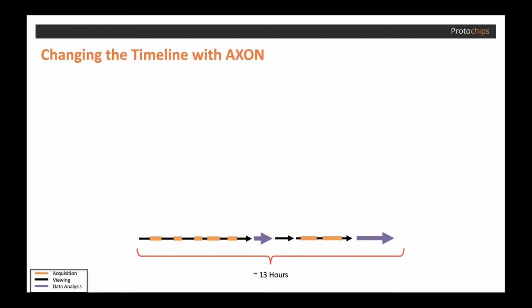Now, since we already knew what the best data from this sample looked like before we started, we know that a more casual or less stringent approach easily could have caused us to fall short in our ultimate results. The complete experiment, performed for the very first time using the new AXON system, took only just over 3 hours.